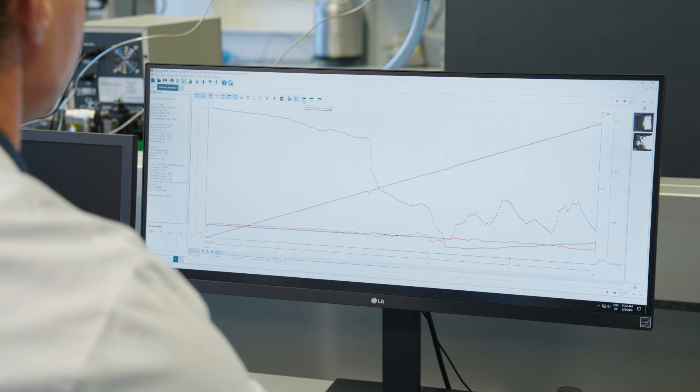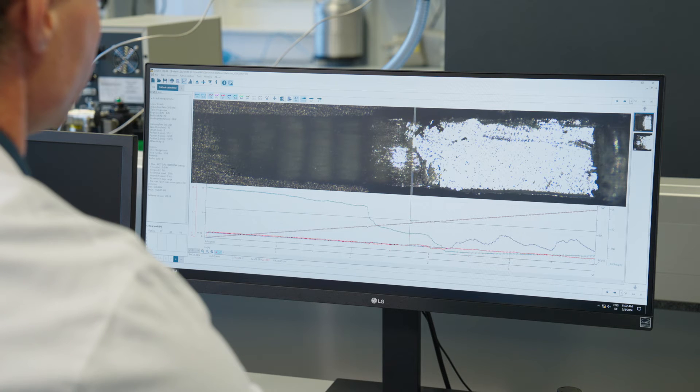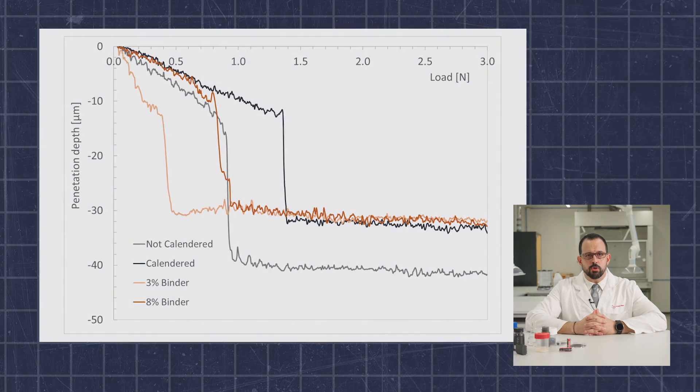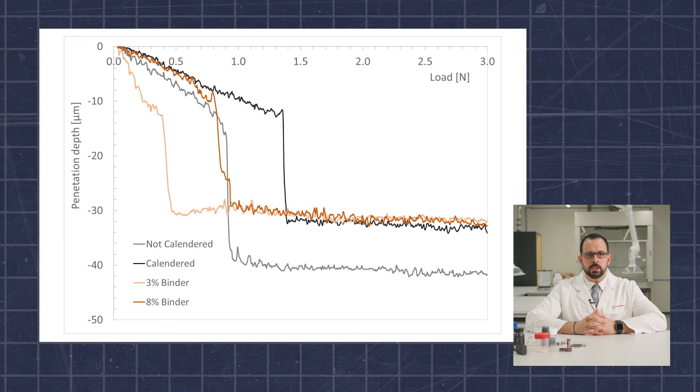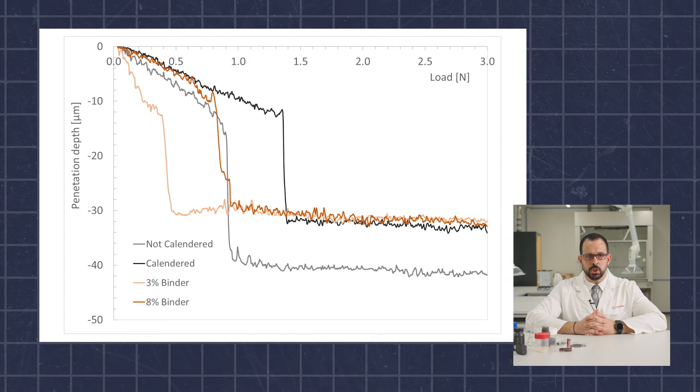Once this is done, the software will record a so-called panorama picture of the entire scratch. This panorama image is then superimposed with a graph of the scratch so that data can be interpreted visually while following the corresponding scratch pattern. In this example, we can see the scratch being performed and at what nominal force complete delamination occurs. The higher the force required for delamination, the better the adhesion of the electrode coating.